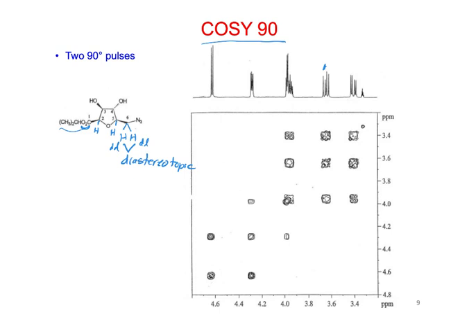Okay. I was thinking that was an ether. Yeah, you said ester. Okay, so I think that we could say that this would be H2 here. And likewise, because H2 is an ester on one side, there's the H3, there's only one adjacent proton, so that one should be a doublet.